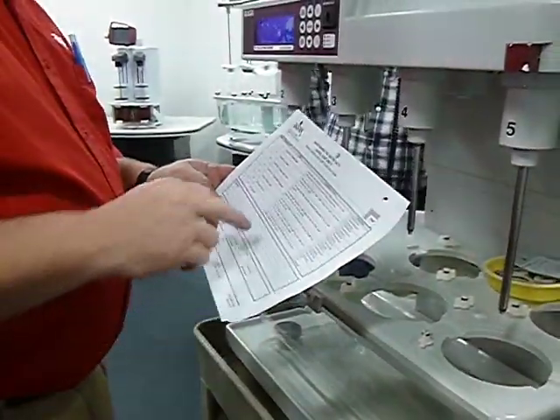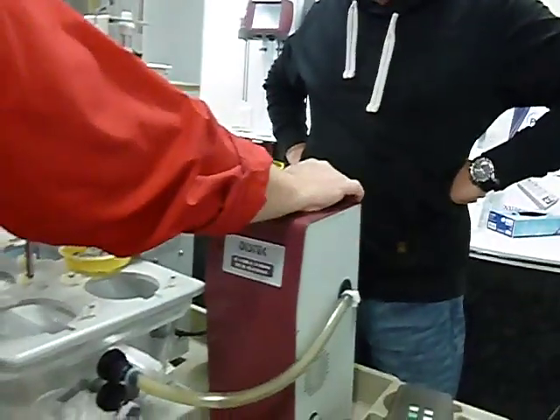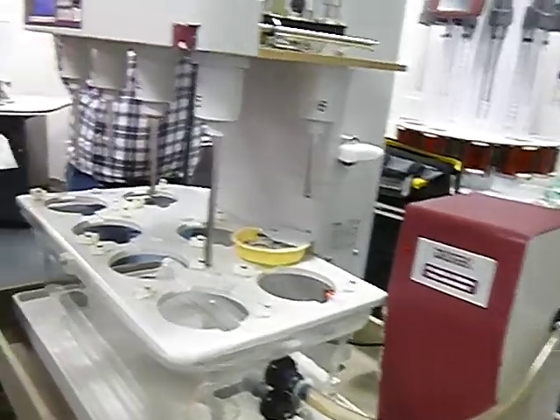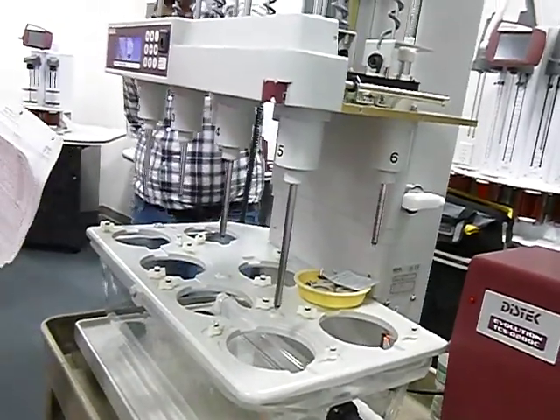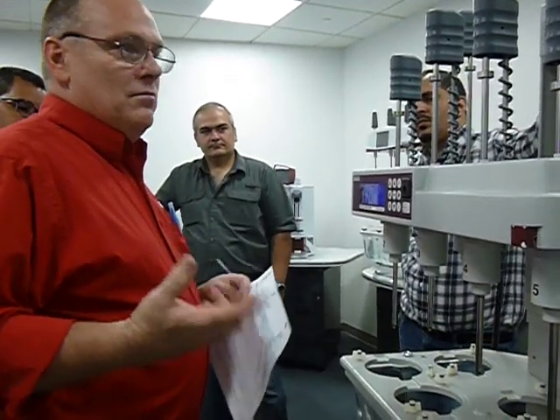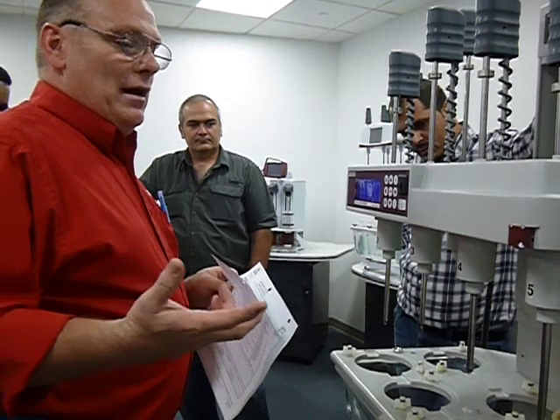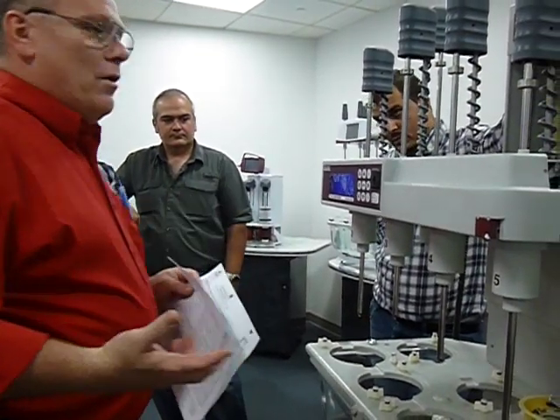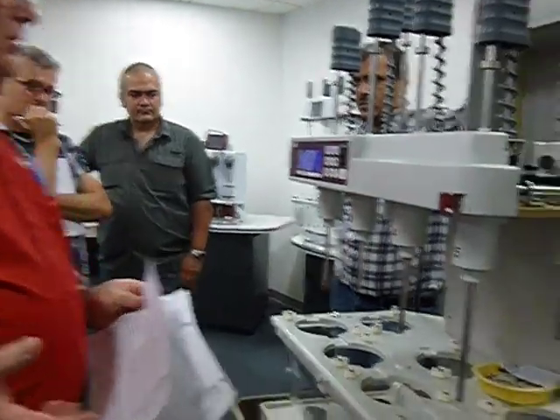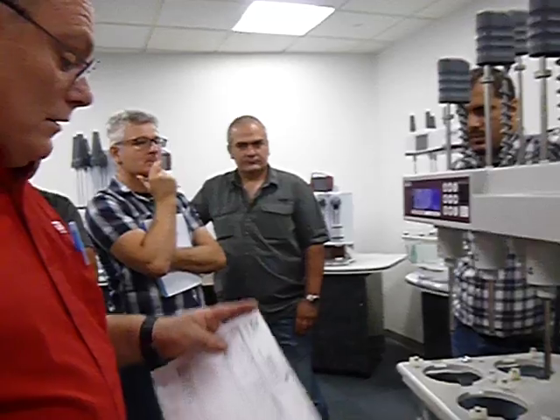The fan should shut down when power is switched off, and then simply turn it back on and make sure that it's coming back on again. There's nothing inside that's preventing it from happening. The reason you want to make sure that it turns off is you don't want anything to have fused inside. The fuse might have, electronically, maybe something got overheated and fused together, and it doesn't stop running when turned off. God forbid they had any kind of electrical issue in the laboratory and it needs to be turned off in order to preserve it from catching on fire.